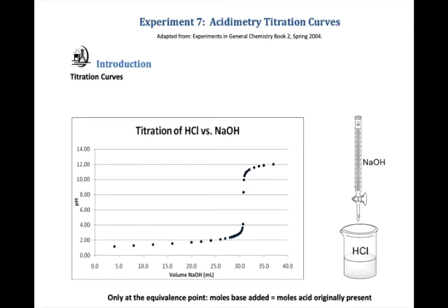As we add sodium hydroxide, the pH will change, and so if we put a pH probe inside our beaker and we put a magnetic stir bar on a magnetic stir plate to mix the liquid, we can make accurate pH measurements and follow what happens when we add sodium hydroxide. So on the diagram, we can see how the pH depends on the amount of sodium hydroxide that we've added.